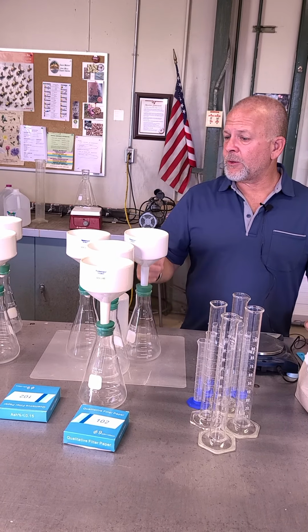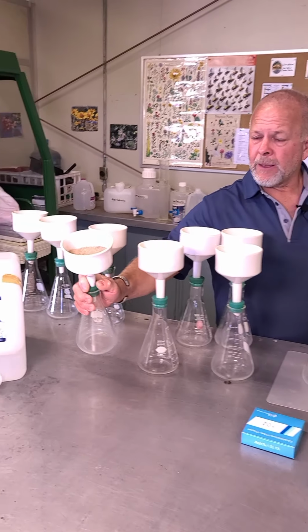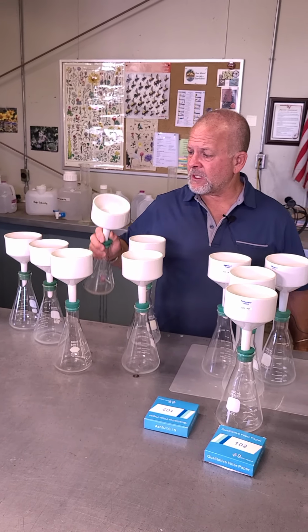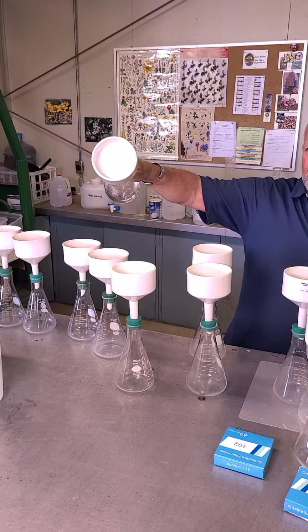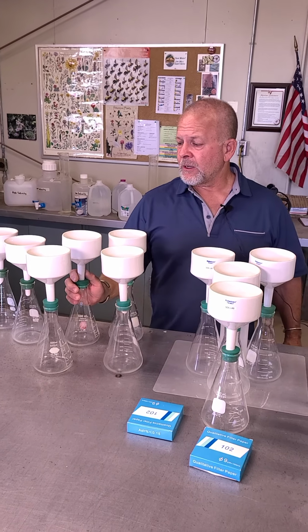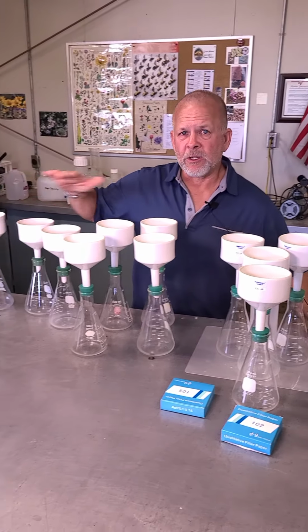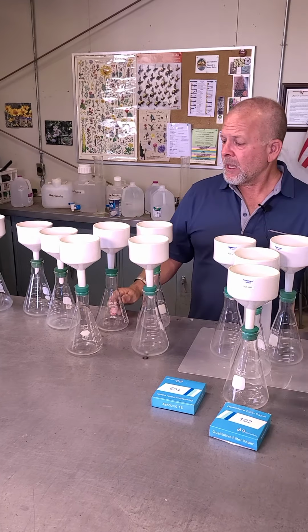So what we'll do is, and I've got some prepared over here, I can show you that we've already put our samples in there, 50 grams of soil. I've got filter papers in here, and I've just wet them down so they'll lay flat, because I don't want the water, when I pour it in, to run underneath that filter paper and go straight down into the flask underneath it. So each one of the filter papers has been wetted, and I've already put soil in this one for our first run, the silty clay loam, soil C.